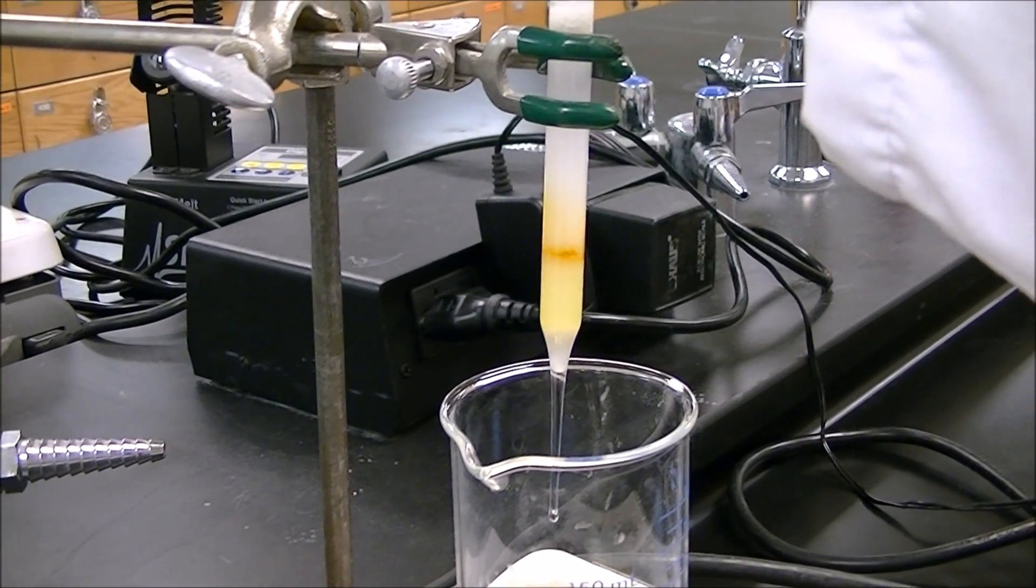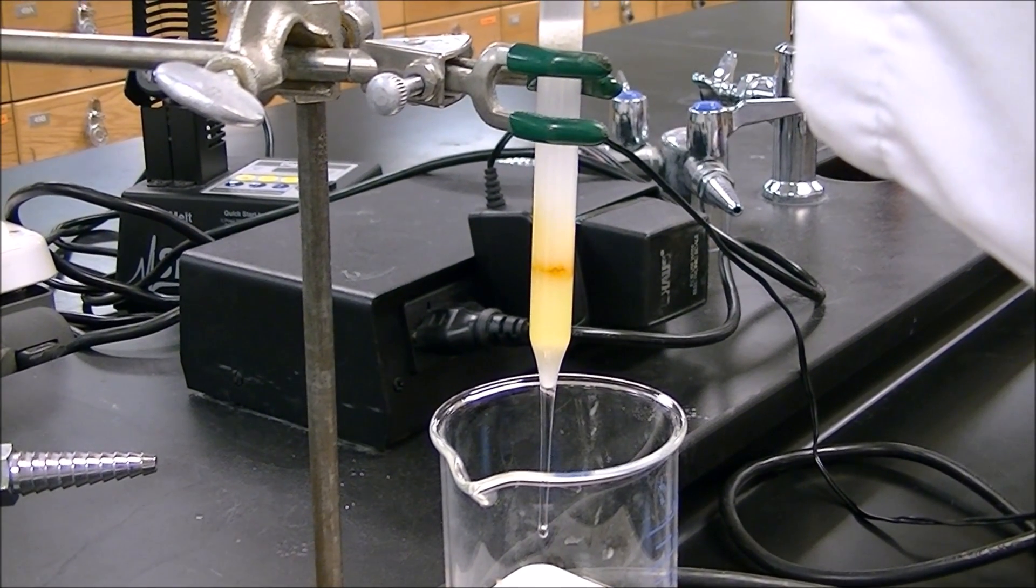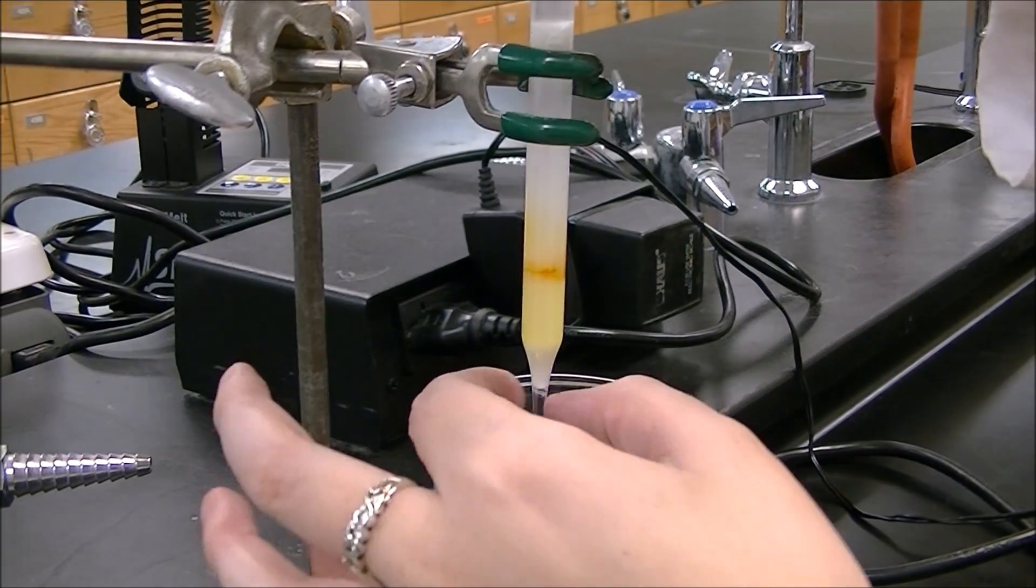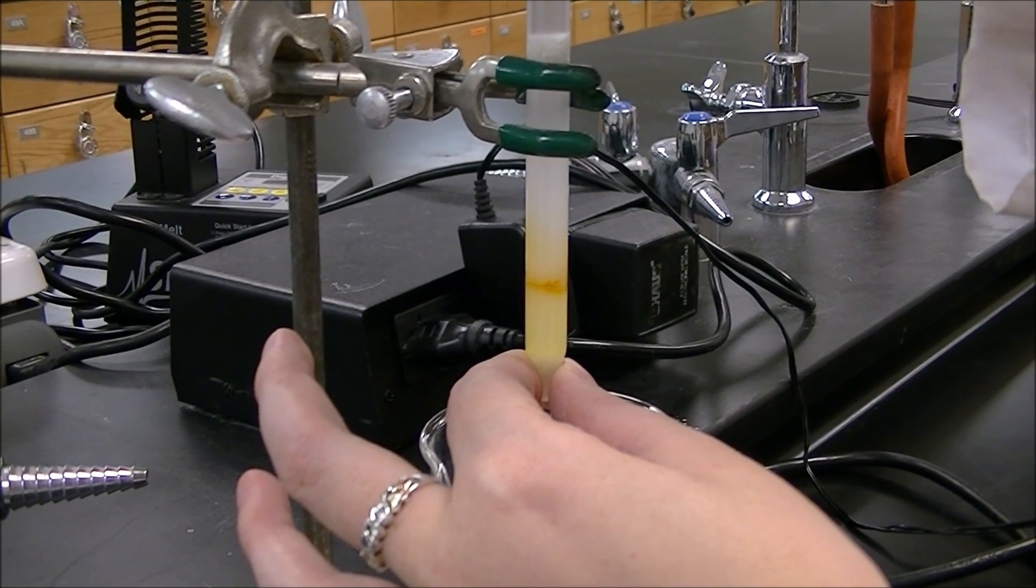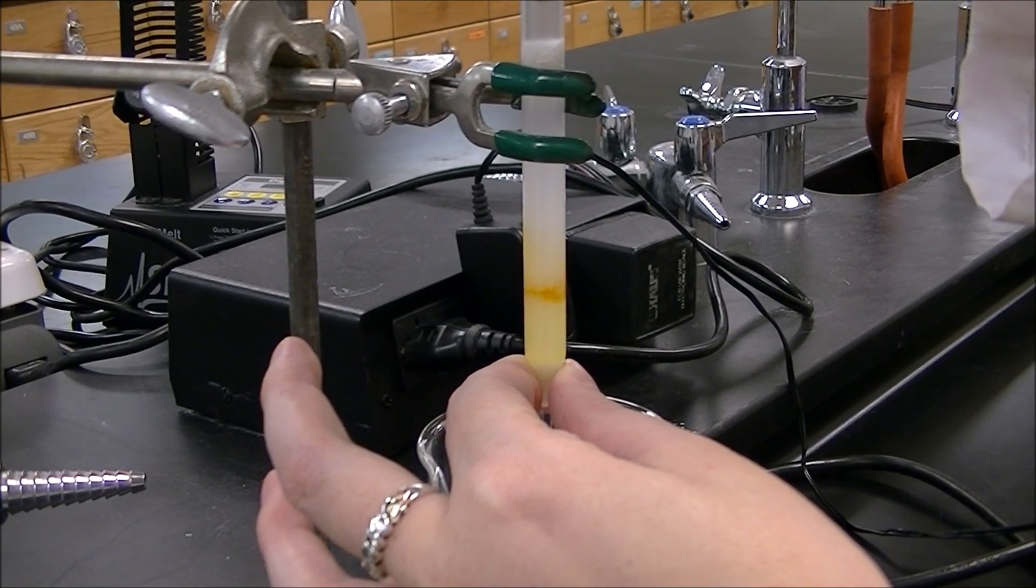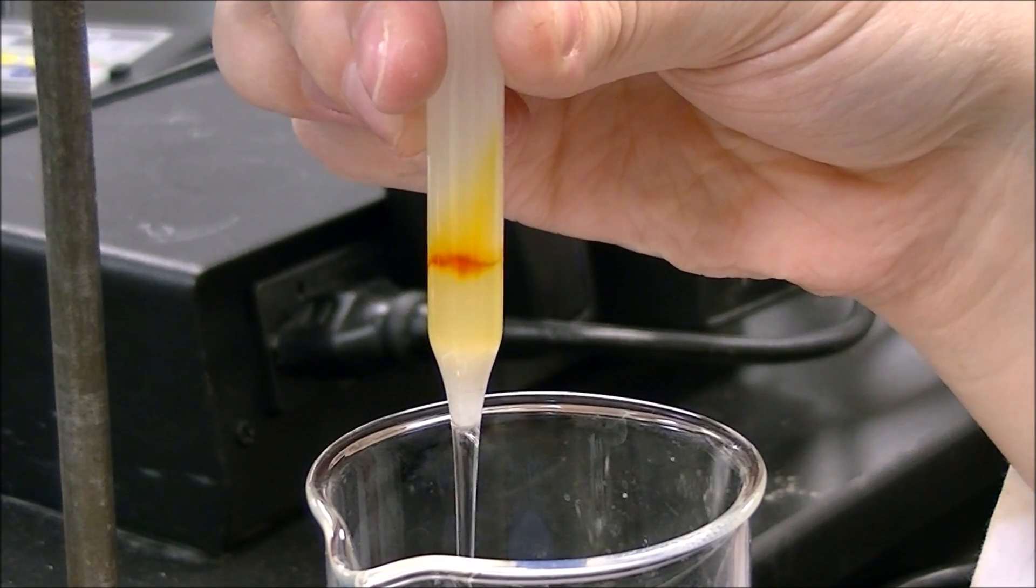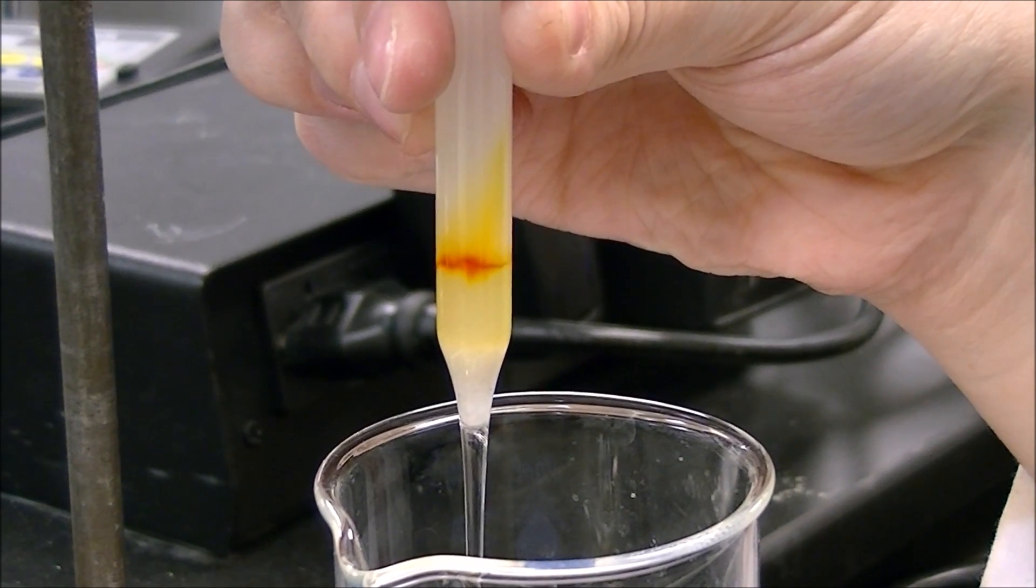Once you've begun your third collection, it may be a good idea to increase the polarity of the mobile phase by making a solution with a higher concentration of methanol. This will help push off the cis isomer faster. Continue running the column until it is completely flushed of the mixture.